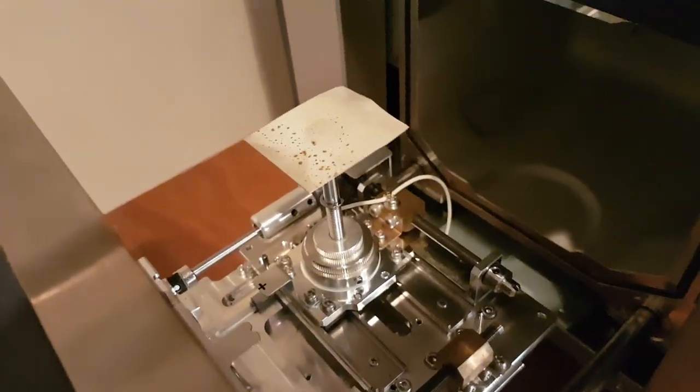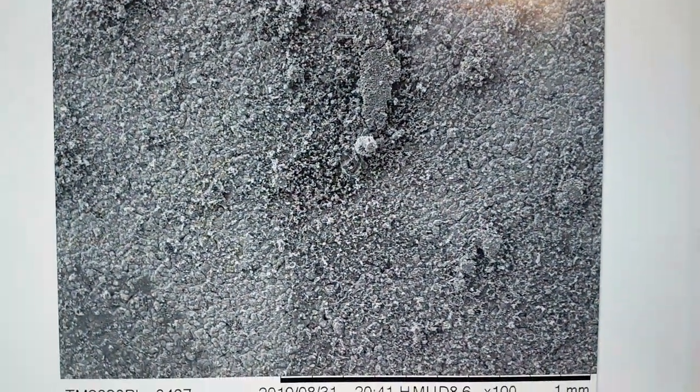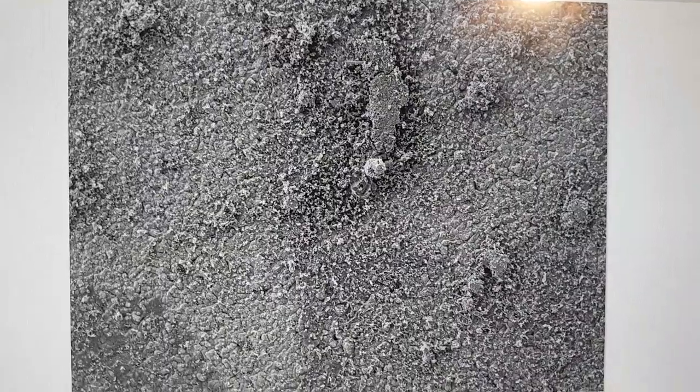It was put into the SEM and you can see it here. It was in there for some period of time today. I'm going to close that up just to keep everything clean in there. A quick look at it to start with - we have it here. This is kind of a plate area. What I saw immediately when I turned it on was this geometric structure in the middle.